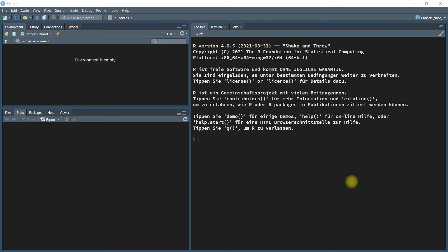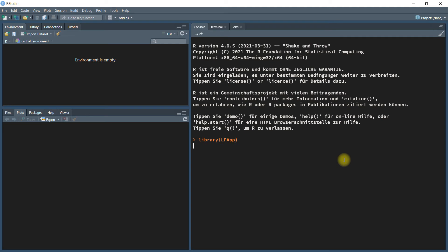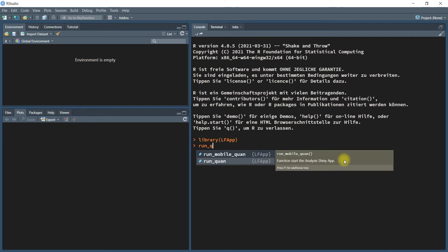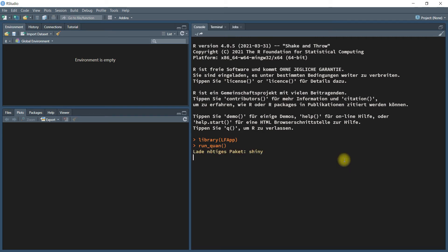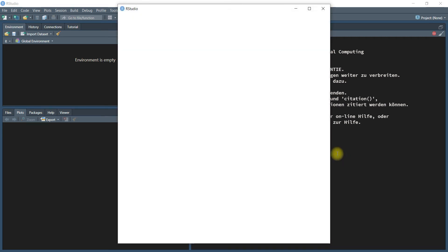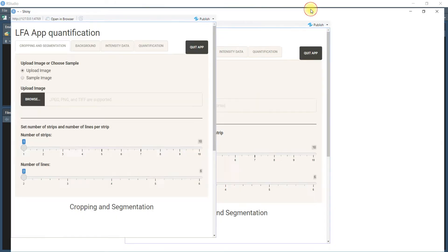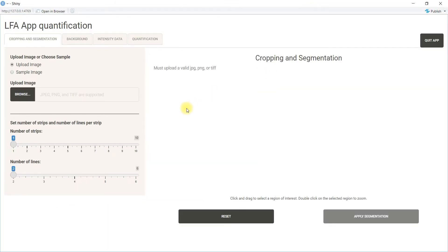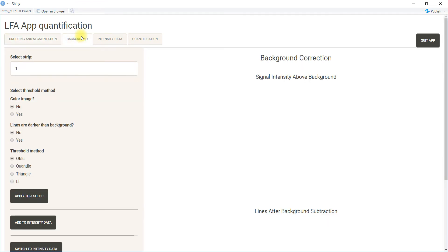To run a quantification analysis with our apps, first we have to load the package. Next we run the quantification app. Here you can upload images, extract information from the images, and get some intensity data.